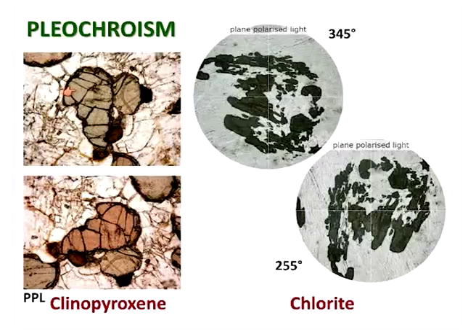Many clinopyroxenes you probably won't see any at all. If you were having a degree of pleochroism, you might describe it by how much the colour changes on rotation, but actually we just call it weak if it's very subtle, or we call it strong pleochroism if it's like biotite, for example, where it's really, really obvious, and you get very strong colour one way and a very weak colour the other way.